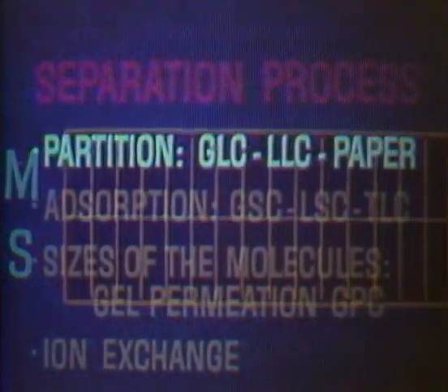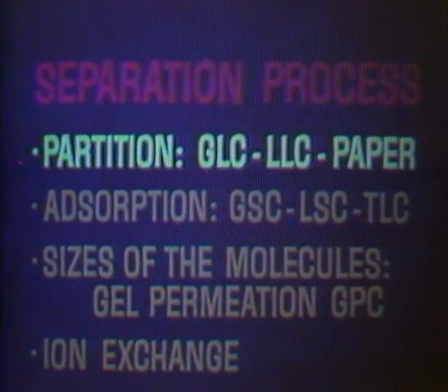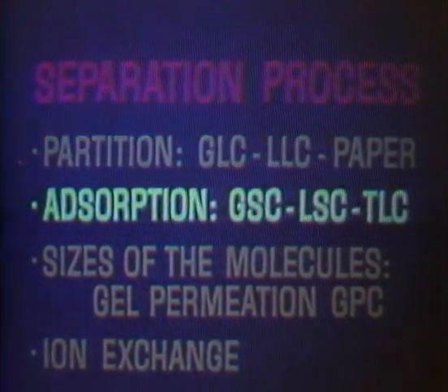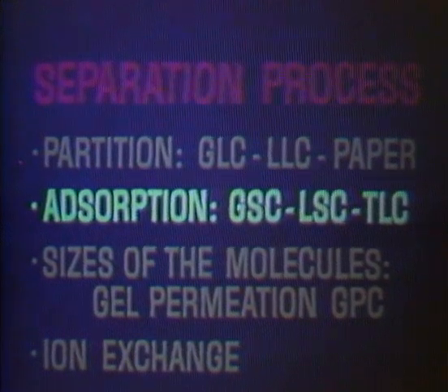The number of theoretical plates can also be increased by making a better column, one having more plates for the same length. Obviously, this is the better solution. Partition is the basis of separation in gas-liquid, liquid-liquid, and paper chromatography. Now let us examine the adsorption process, which is the basis of separation in gas-solid, liquid-solid, and thin-layer chromatography.